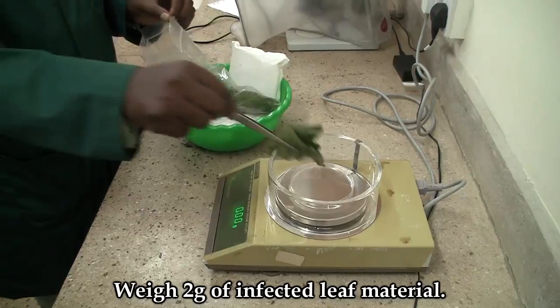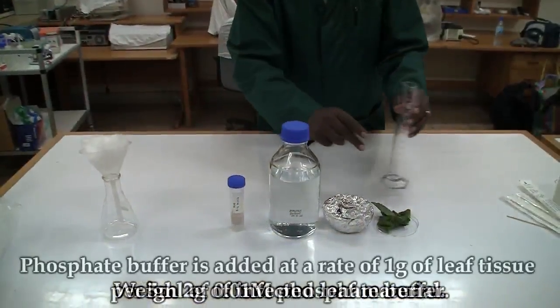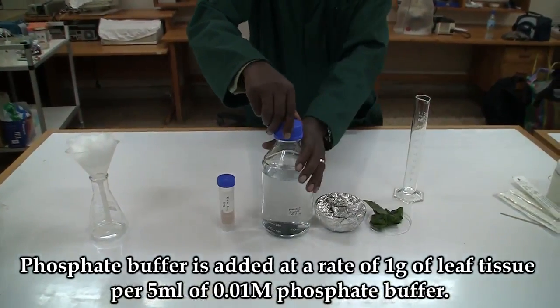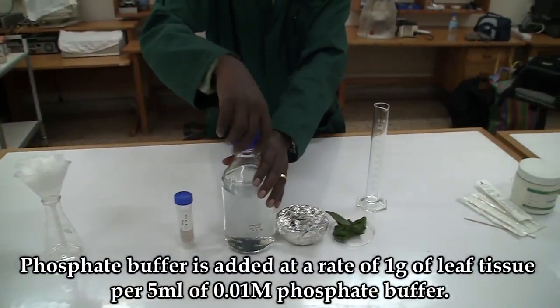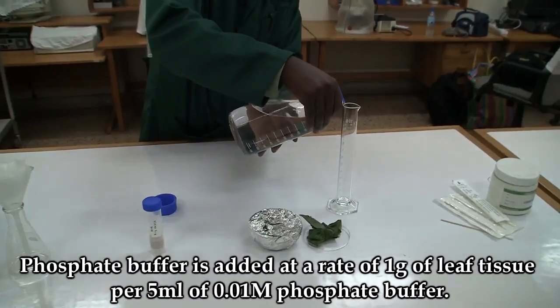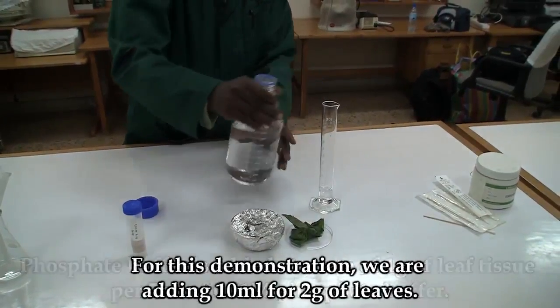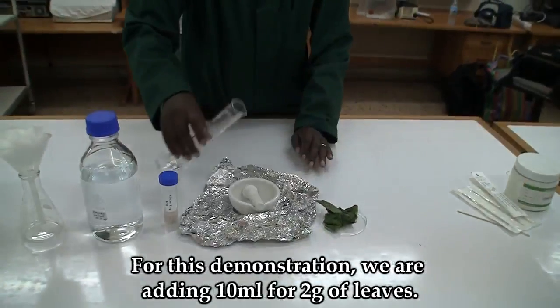Weigh the leaf material — in this case we weigh 2 grams. Weigh out 10 ml of phosphate buffer. Phosphate buffer is added at a rate of 1 gram of leaf tissue per 5 ml of phosphate buffer. In this case we add 10 ml for 2 grams of leaves.